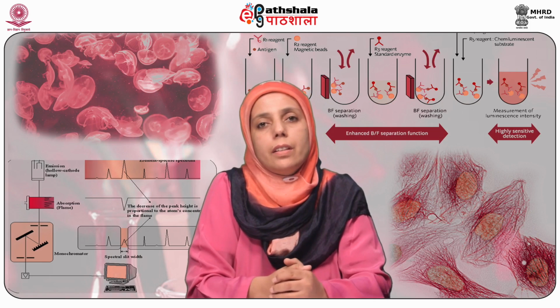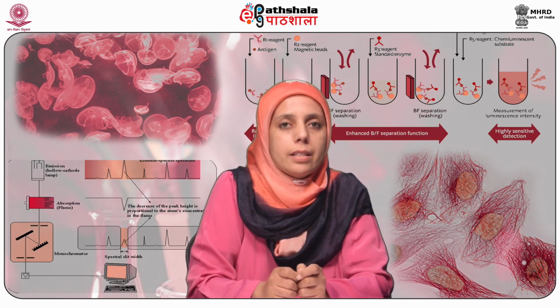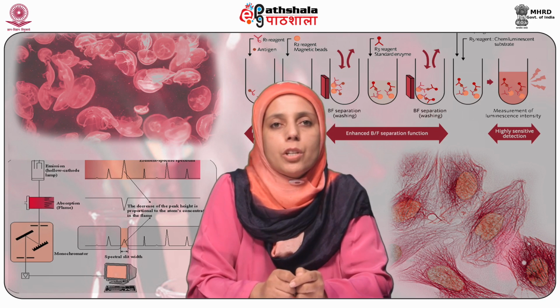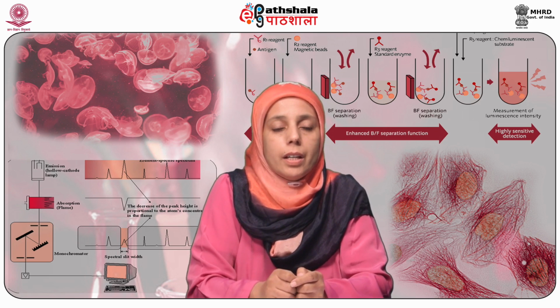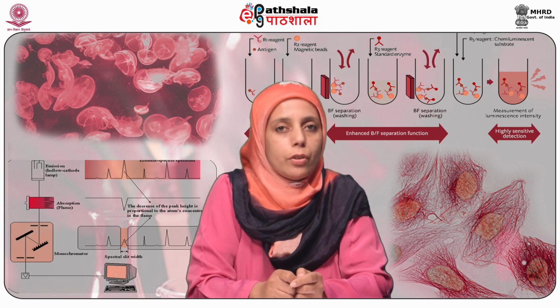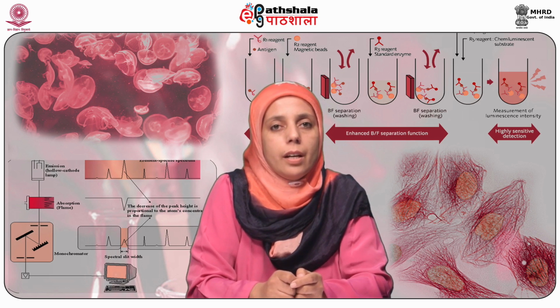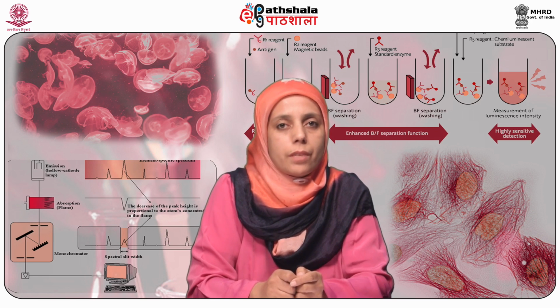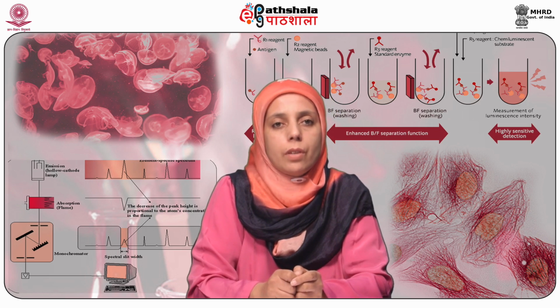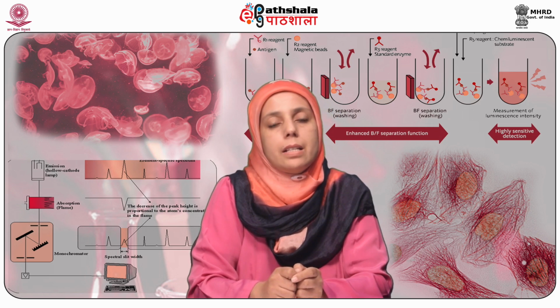So to start with the definition of a fluorophore, fluorophores are chemicals or dyes which are used to mark proteins, tissues, or cells for examination by fluorescence microscopy. These chemicals work by absorbing energy of a specific wavelength region referred to as the excitation range, and they re-emit the energy they have absorbed during excitation in another specific wavelength region, which is known as the emission range. All these fluorophores are used in numerous biological studies.